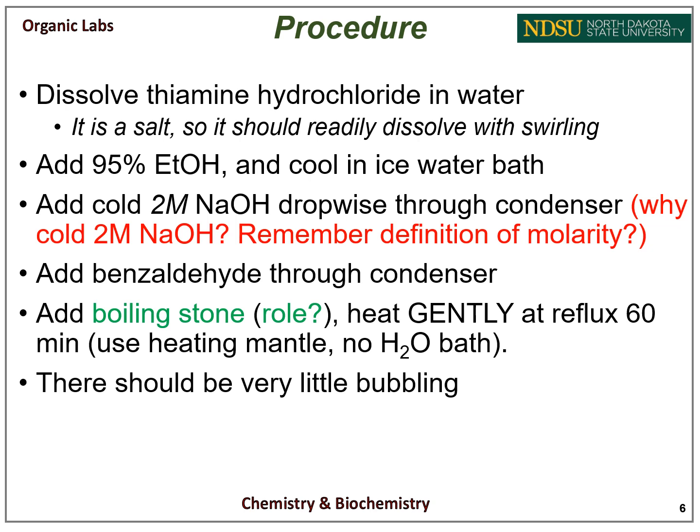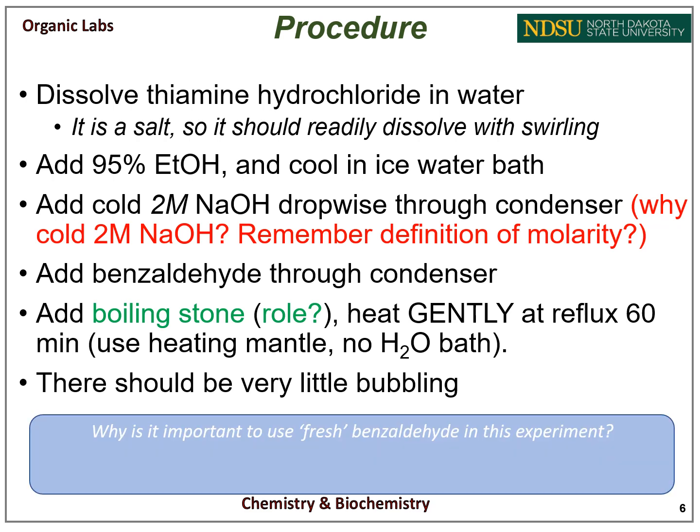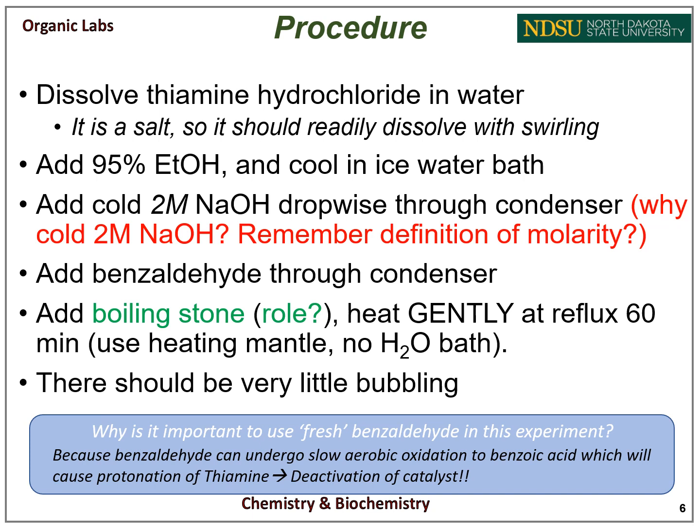There should be very little bubbling seen, but you should be able to see the reflux ring in your condenser. It is important to use fresh benzaldehyde. But why? Benzaldehyde can undergo an oxidation reaction and will form benzoic acid, which will react with thiamine.